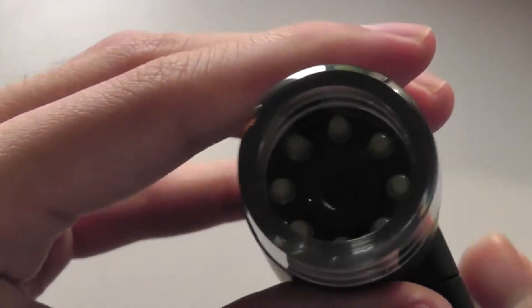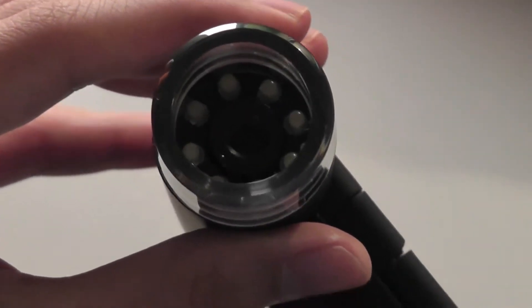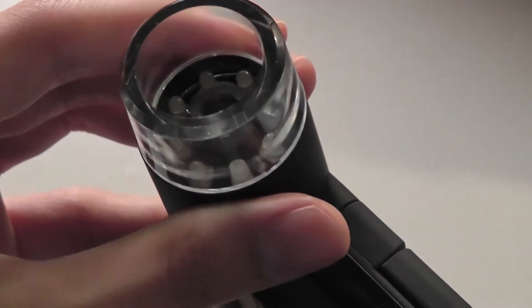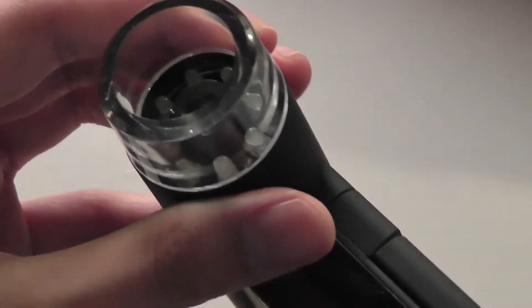On the sides, you can see there's a ring of LEDs which illuminates darker environments, and it can also provide an IR mode which allows you to see even in the dark.